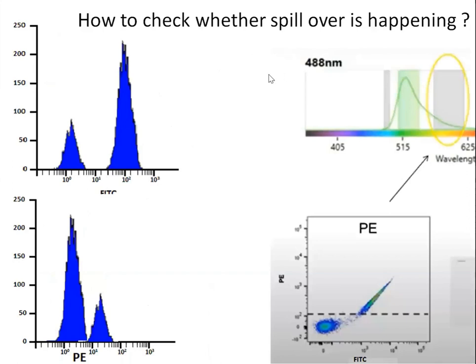Now, how do you check whether spillover is happening? For example, you want to check whether the fluorescence from your FITC fluorochrome is getting spilled over into other channels. Normally the FITC signal will be collected by the FL1 channel. To avoid confusion, I'll say the FITC fluorochrome should be collected only by the FITC channel. It should not be collected by any other channels like the PE channel, ECD channel, PC5 channel, or PC7 channel. So FITC light should be collected only by the FITC channel. But how do you check whether this spillover is happening or not? What will you do? Any random guesses?